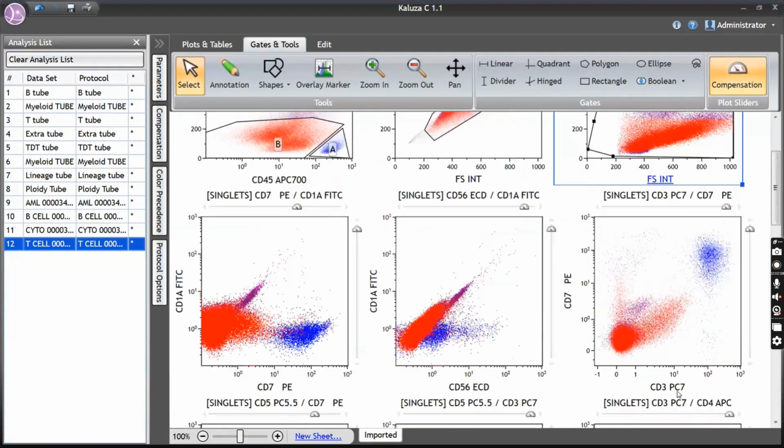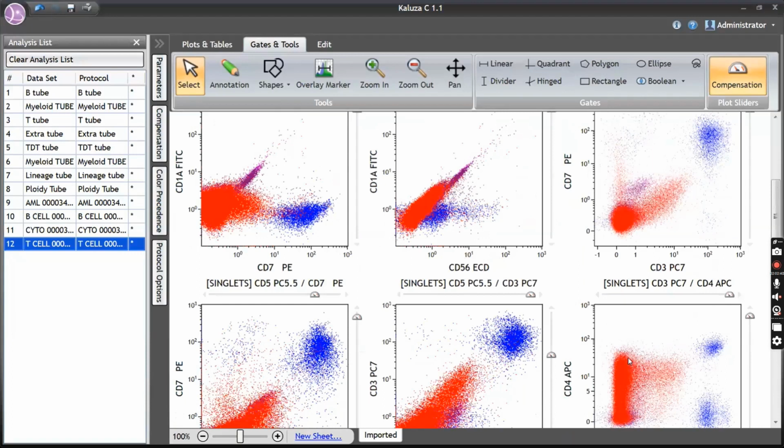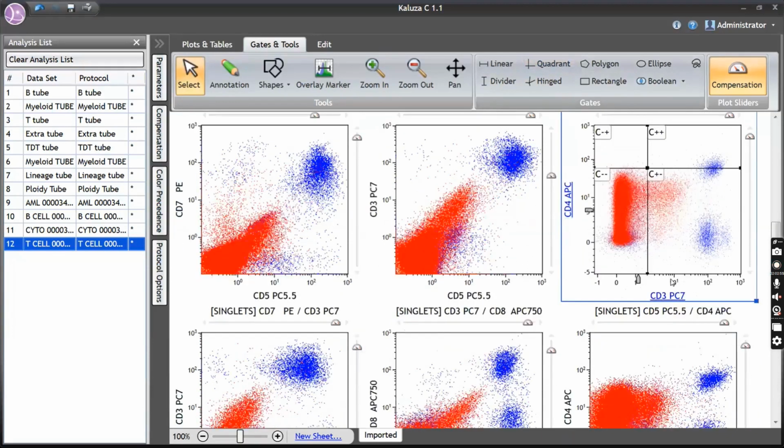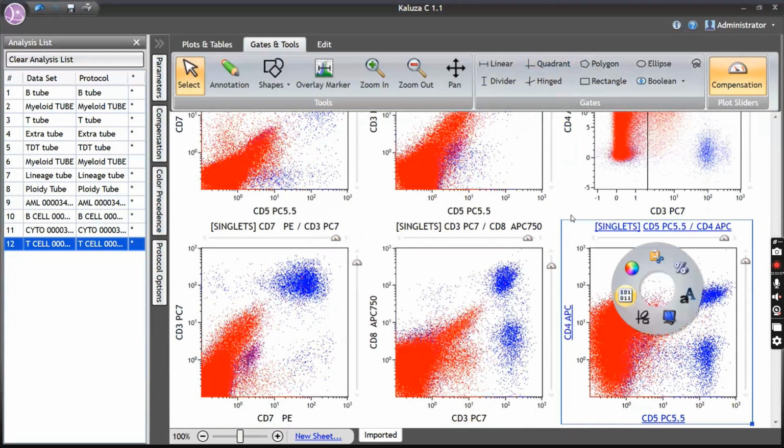If the processing is all done correct, then this is something. And see the intensity. It is not just stopping somewhere here. It is almost reaching up to the internal control, which is quite well there. So it is almost like a processing error? Exactly, the internal controls are quite in place, so it cannot be a processing error.